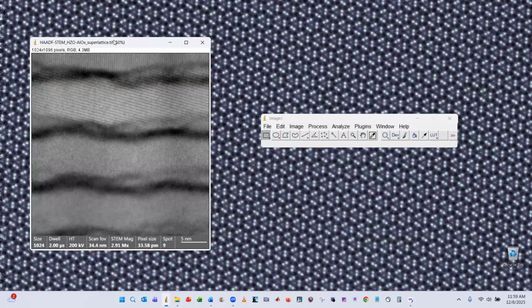You can compute the discrete Fourier transform from an arbitrary rectangular area. That can be done, but again, the FFT algorithm specifically relies on the area being square and power of two dimensions. But the point I wanted to make is that you can isolate the FFT effectively from any arbitrary sized or shaped area.